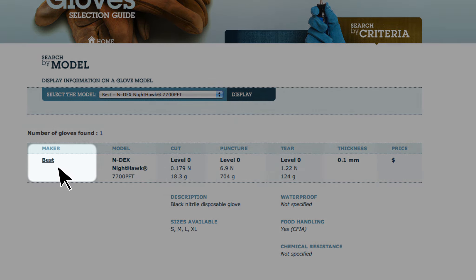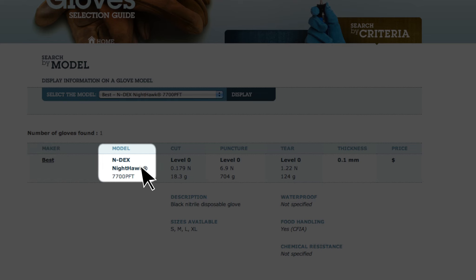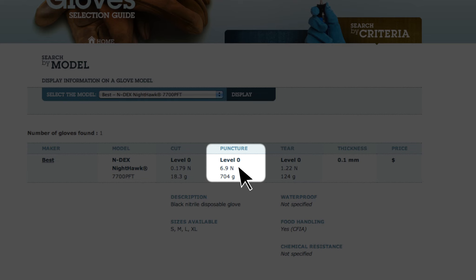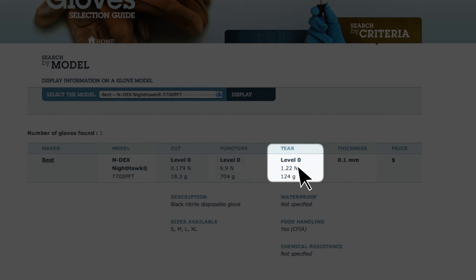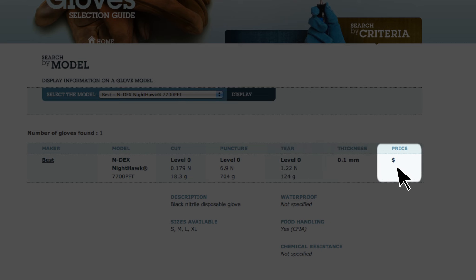we find the manufacturer's name linked to their website, the name and number, the cut, puncture and tear resistance that was measured, and the glove thickness.